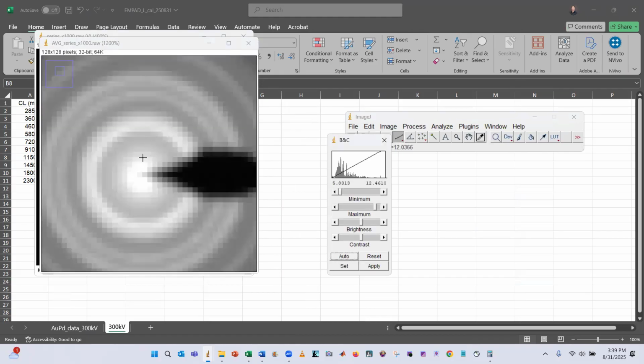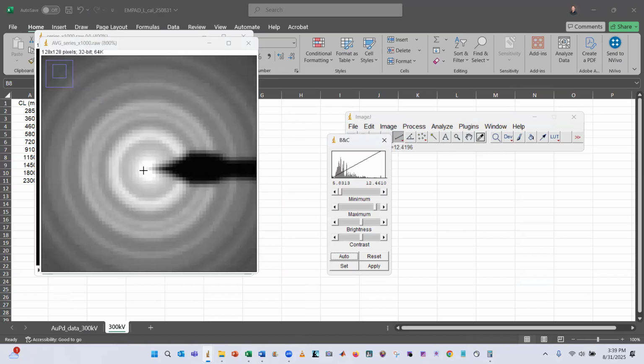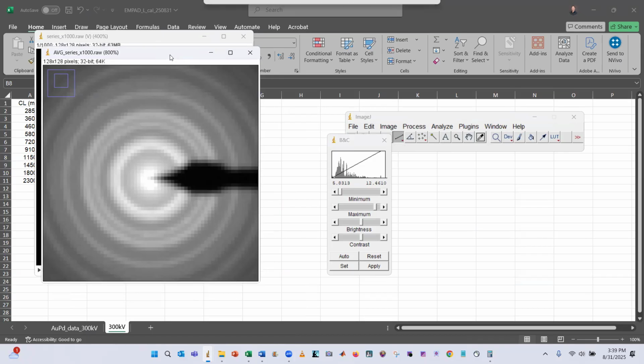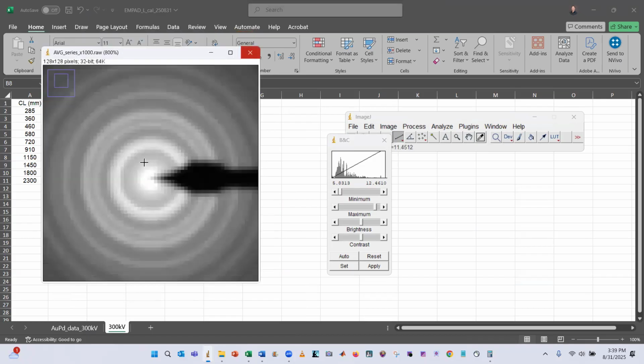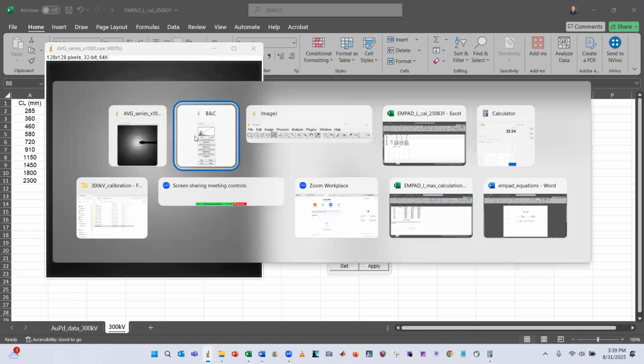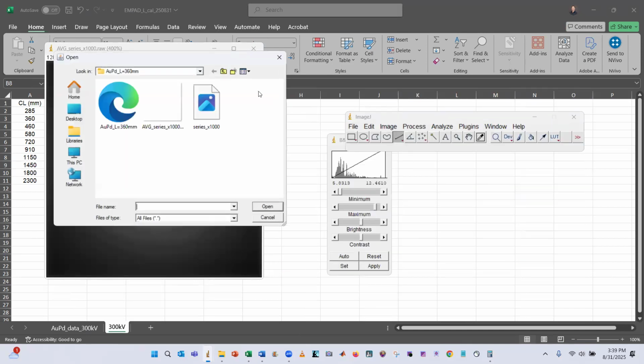Okay, so you can kind of see, right? So, I mean, it's tough to kind of make heads or tails of what's what here. I think this guy right here is the third ring, actually. So this is where if we have another one opened up, it's going to get a little easier to make heads or tails of this.